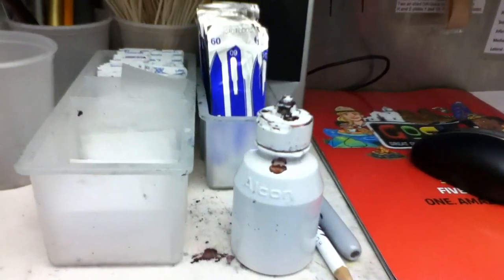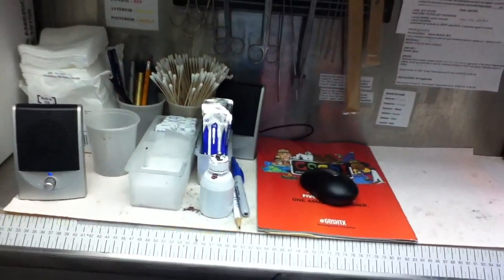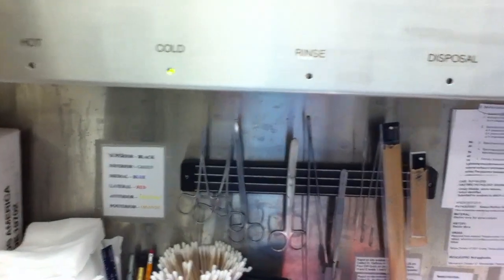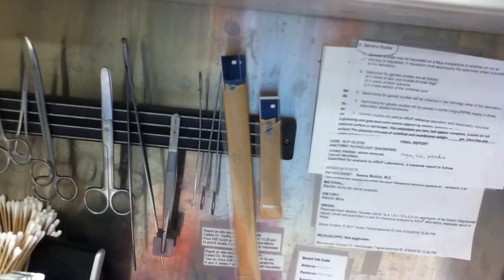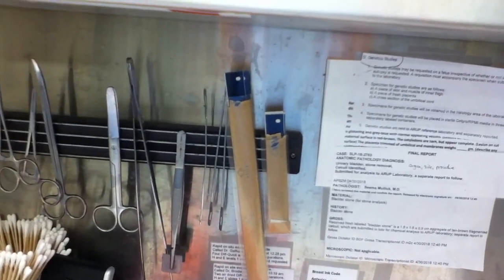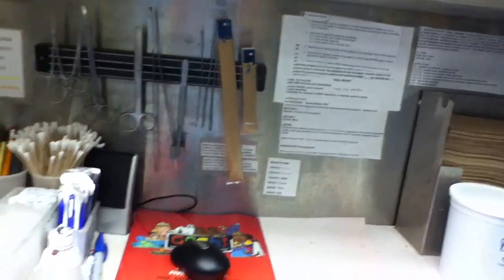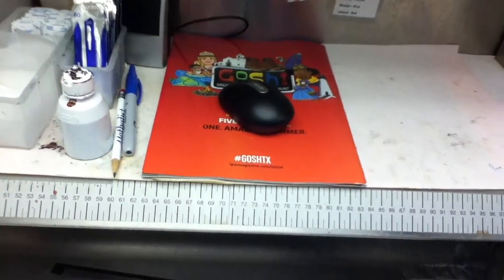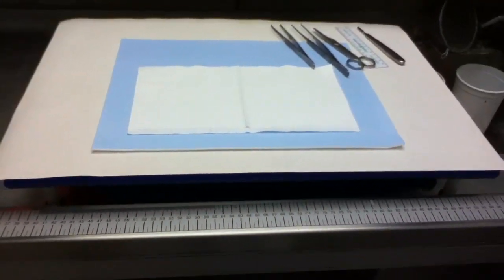This is a little eyedropper I converted for hematoxylin so I like to ink my really small biopsies so they won't get lost. I use the magnet strip to store my blades up out of the way — they're open and accessible but not going to stab anybody. I have notes taped up there for things to remember, and a wireless mouse in the middle.